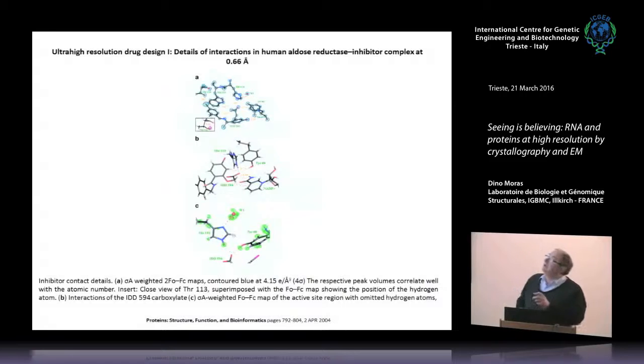And here you have, for the step, what we showed before. In crystallography, one does a difference map. That is, you take the difference between the observed map, the experimental map, and the map that you calculate with the model you have. That's a difference map. If your model reflects accurately the diffracted density, you should see nothing. If you see a peak, you have to interpret it, because this is what is missing, and you look for what that means. So that's the difference between the map I showed you before and this density map.